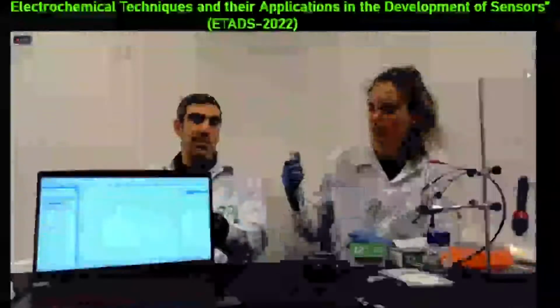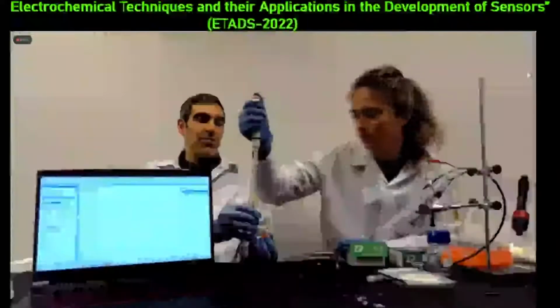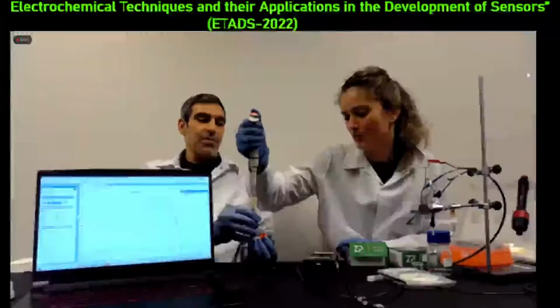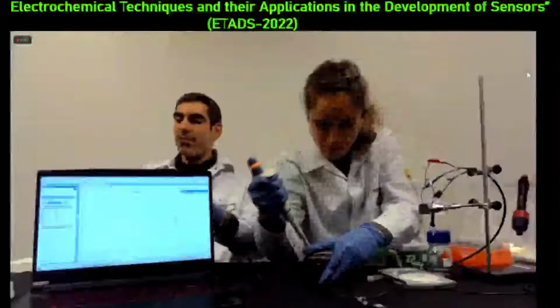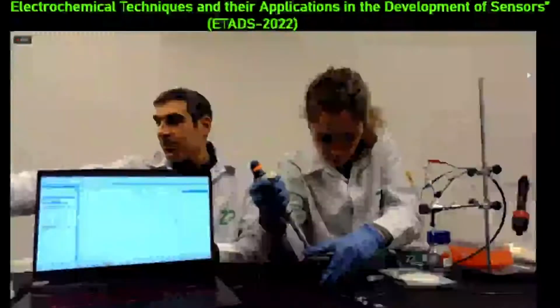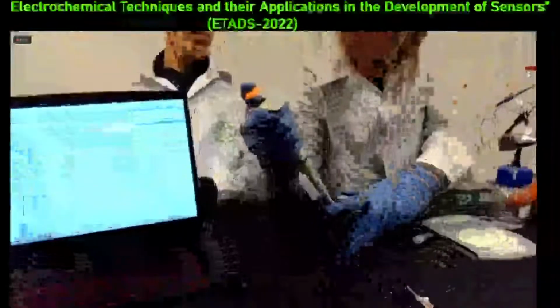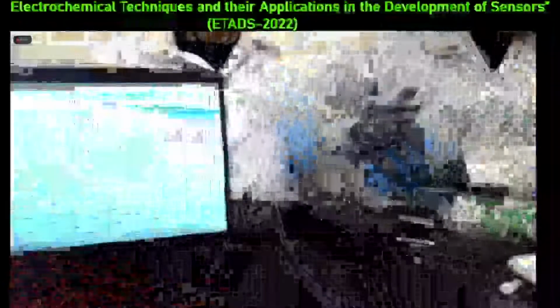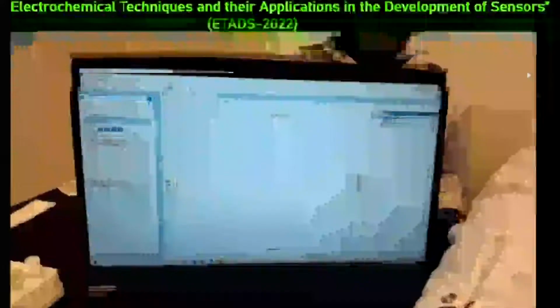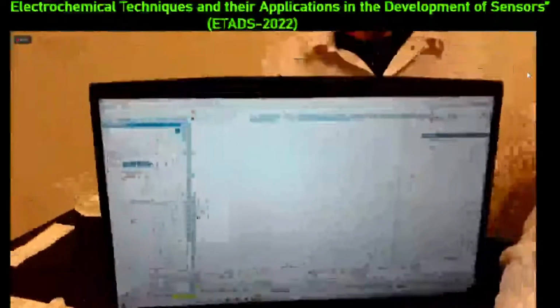All right, so what we will do, we'll do the same as we did before. We will pipette 50 microliters of the solution. We cheated, so we already mixed the solution before we got here. But as I said, it's a mixture of a buffer and the Tabasco sauce, so that we have an electrolyte in the solution. And so I covered all the electrodes with the solution now. And what I'll do, I'll hit run, and it'll start scanning.